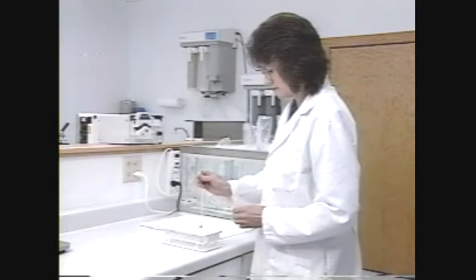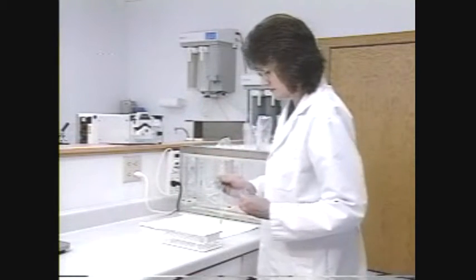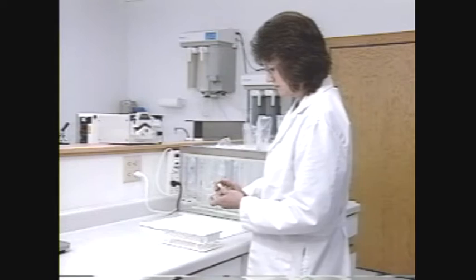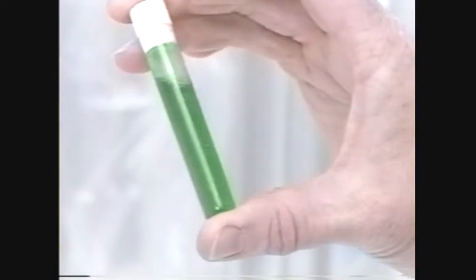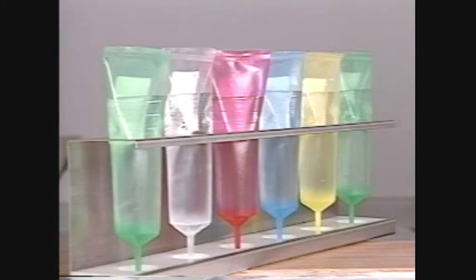The dye can be added first to a small amount of extender. Then the extender is colored using this diluted dye sample. Be certain that the extender with the dye and the semen are the same temperature prior to mixing. The evaluation of the extended semen should be performed after the dye is added. Minitube now has available colored semen tubes. These provide a convenient method to color code doses of semen without the additional labor required to add extender dyes.